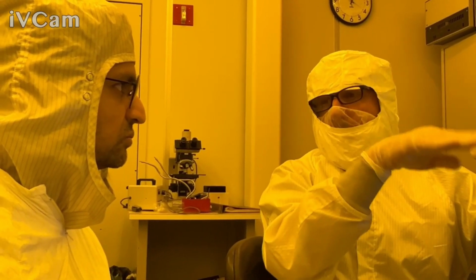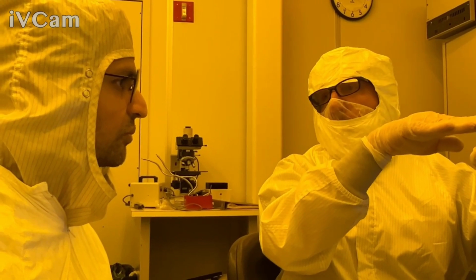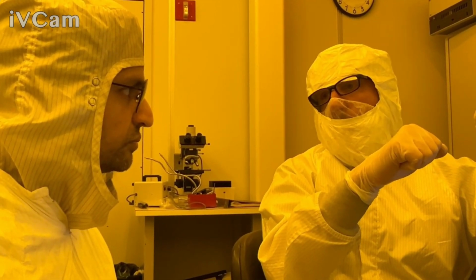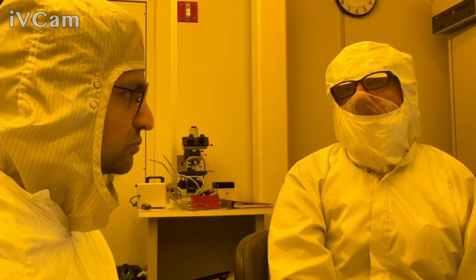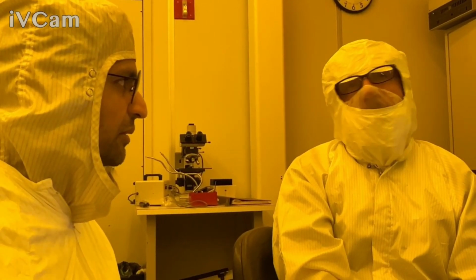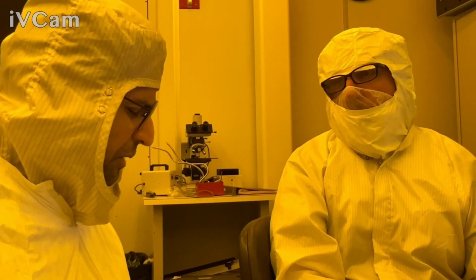If you had some roughness on that silicon nitride, say a few nanometers of roughness, by default what we're going to do is put a surface layer above the nitride that has an index halfway between that and air, which is an index of 1. So we put a surface layer above that of, say, 1.5 index, essentially, and fit for a thickness. And that can correlate well in some cases. But not like AFM. AFM is more of a profile measurement.